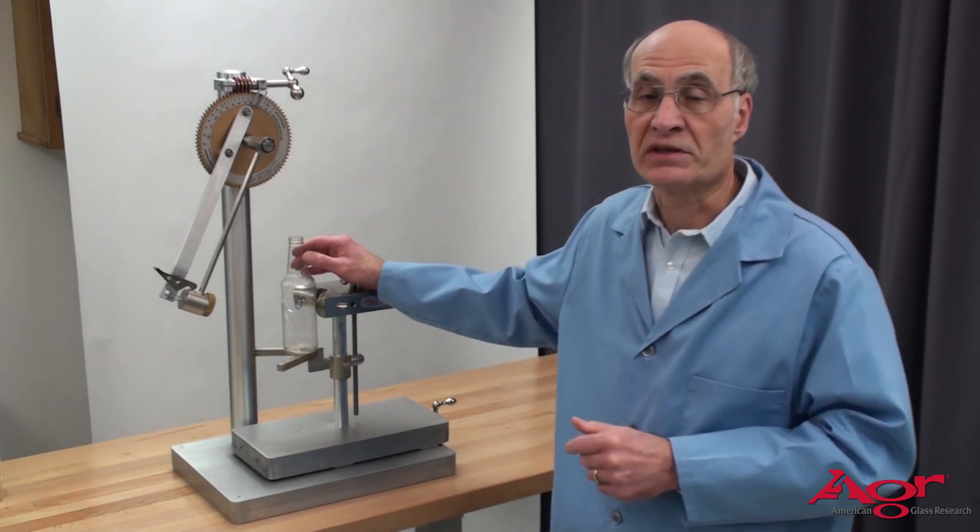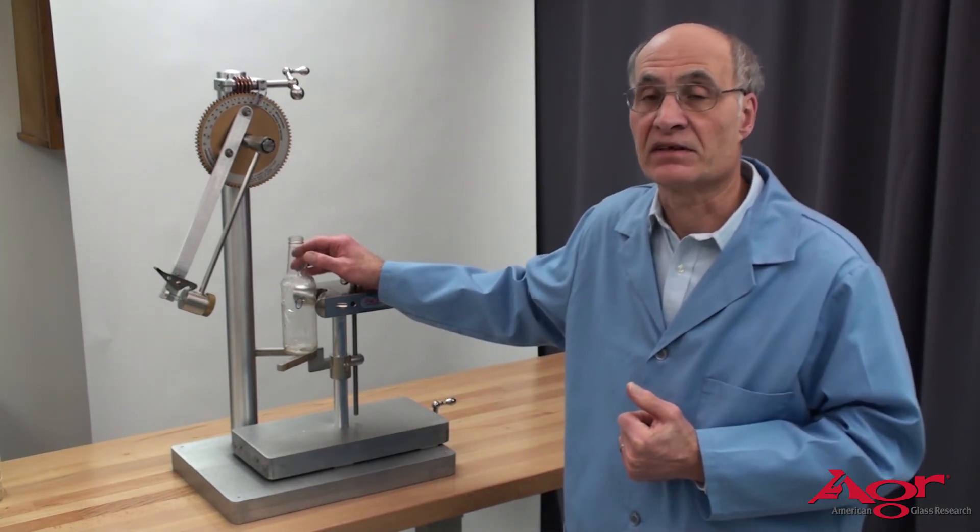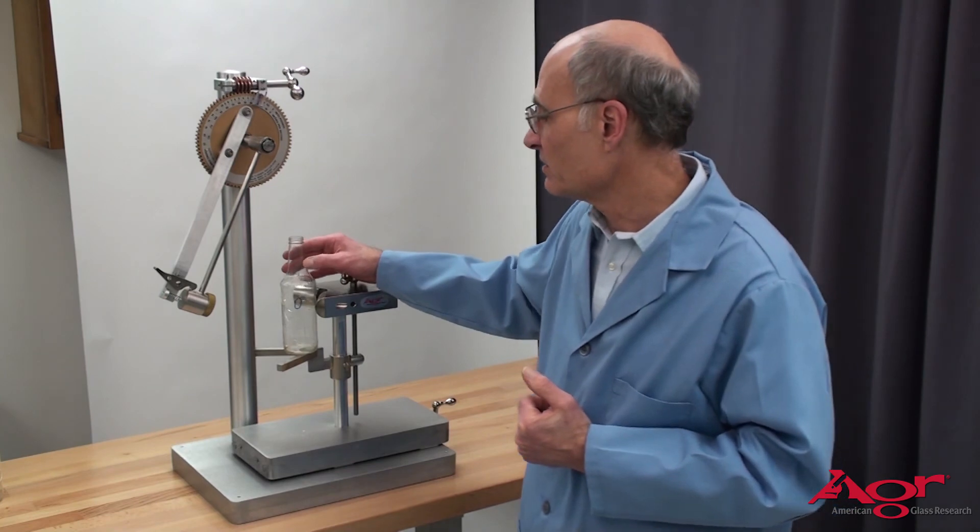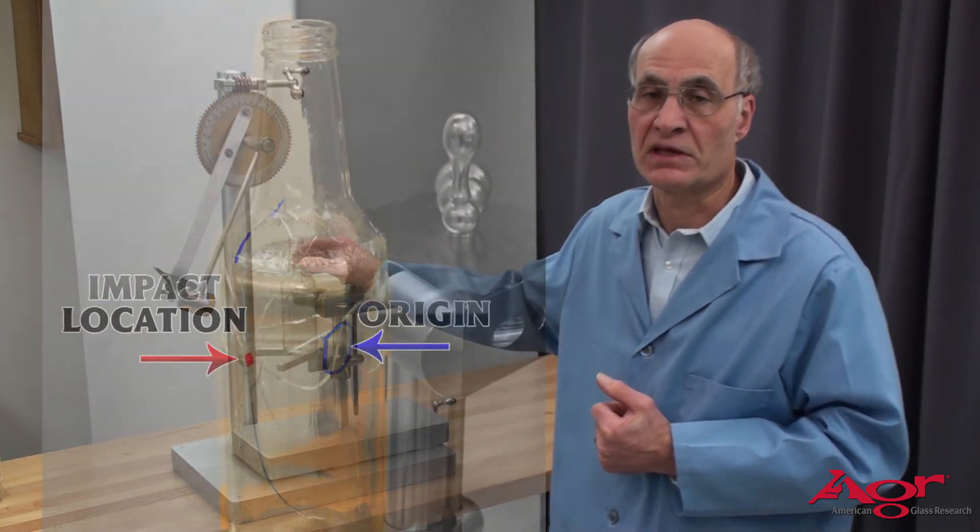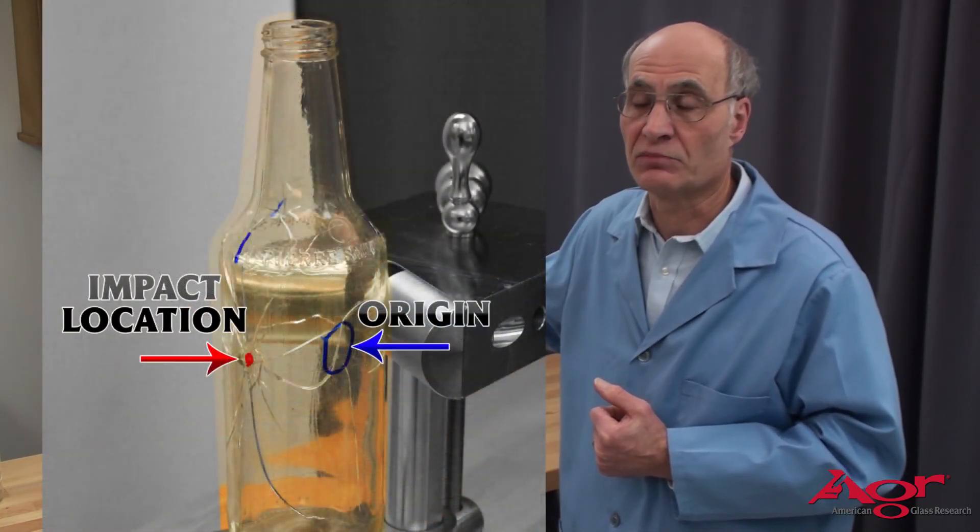We impacted the bottle at one point, but the fracture is off to the side of that defect on the outside. The defect that we have put on the sample is shown by the blue mark.